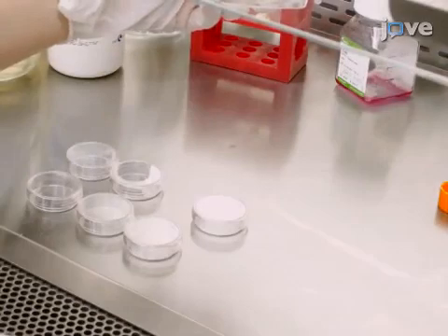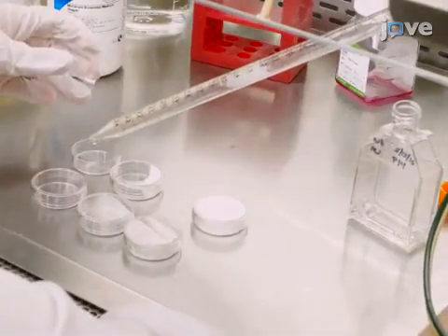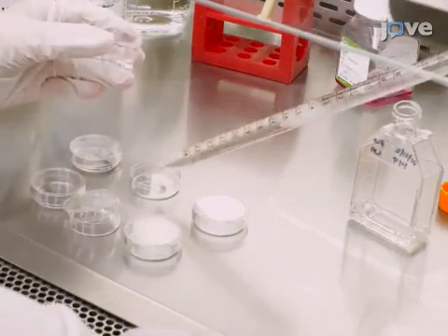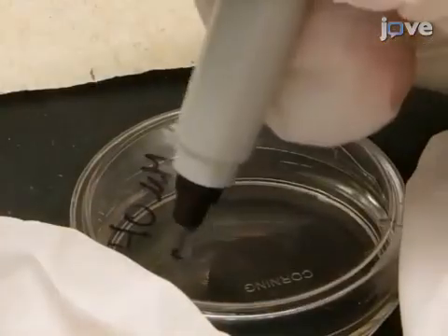To begin the experiment, seed 3 × 10⁵ WB F344 rat liver epithelial cells onto 35 mm diameter culture plates containing Eagle's modified medium plus 5% fetal bovine serum. Culture the cells in an incubator until they reach 100% confluence, and continue with the experimental treatment of the cells.